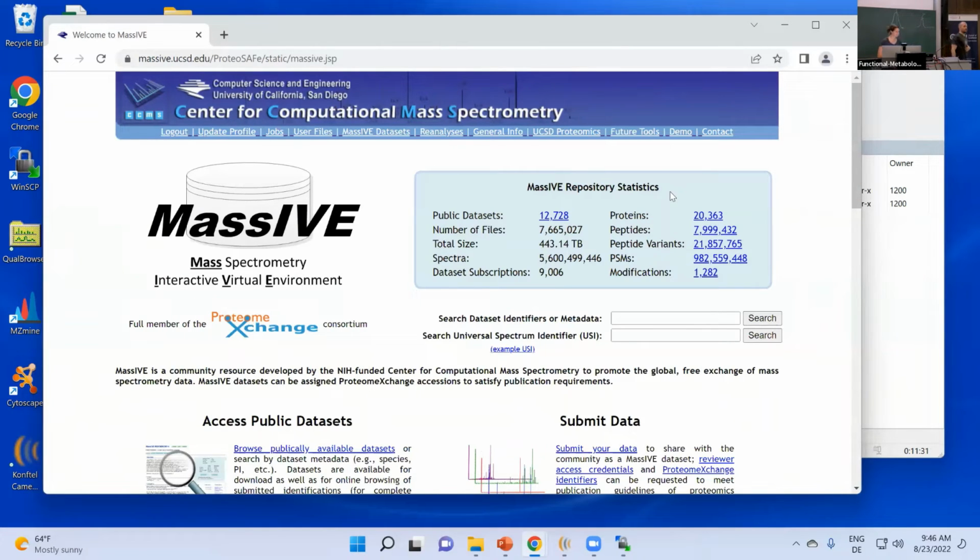One thing about choosing the password for your user account: make sure to remember it or write it down, because I think there is no recovery option. When it's gone, it's gone. I didn't know that. So that's important to note.